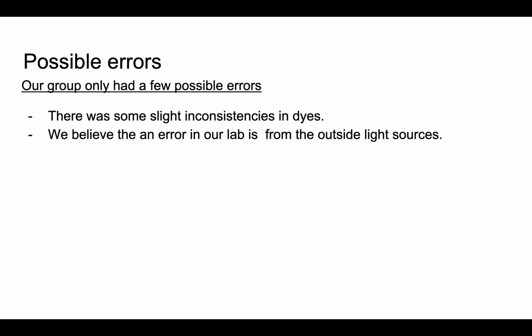Some possible errors: we didn't have many, but the two that I think we had were that there were some slight inconsistencies in our dye, and we believe that most of the error in our lab was due to the outside light sources in the class.